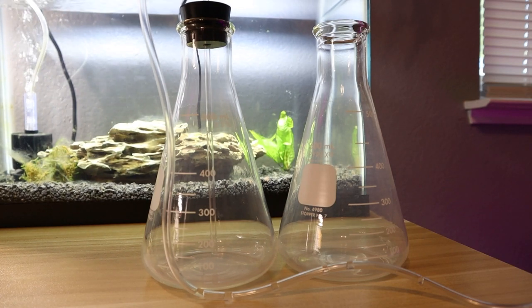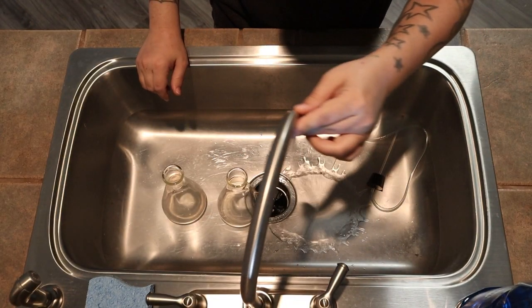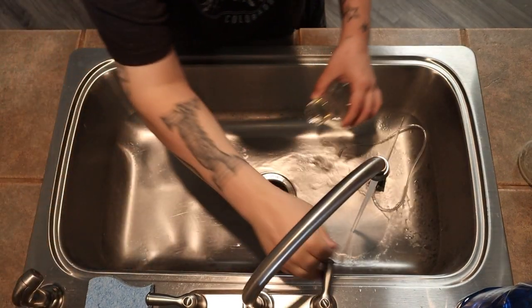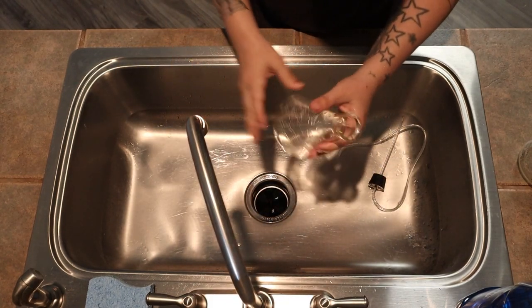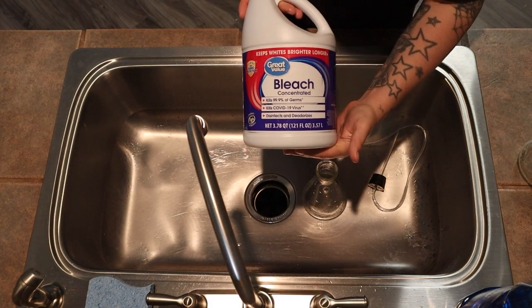We technically aren't sterilizing unless we use an autoclave or a pressure cooker at the least, and since this video is aimed at hobbyists like myself, we're just going to sterilize our water by boiling it. Now that I've rinsed it out with hot tap water, I'm just going to add a little bit of bleach.